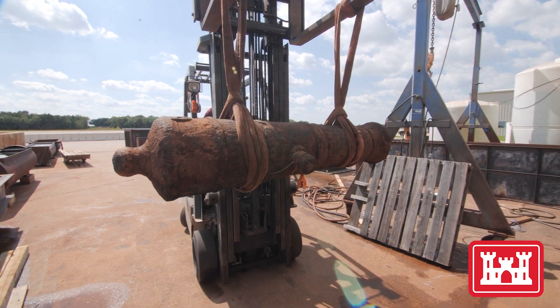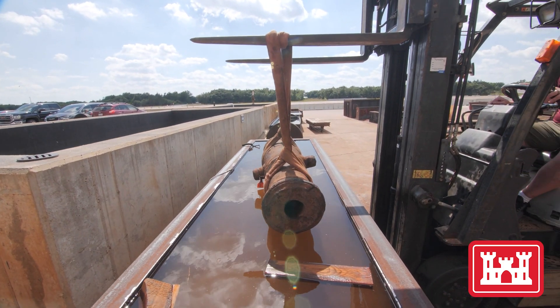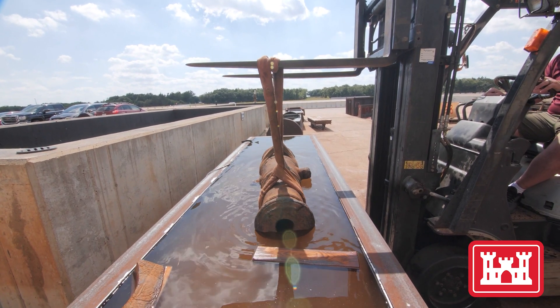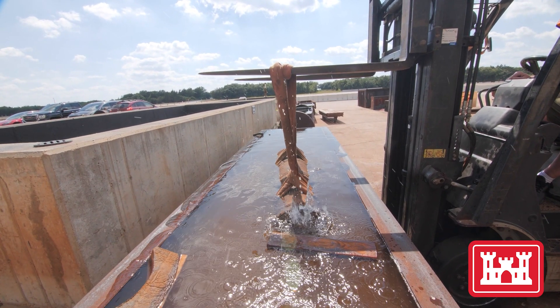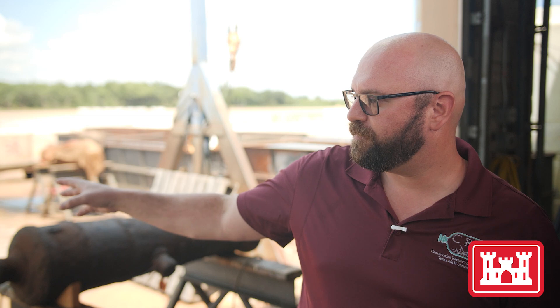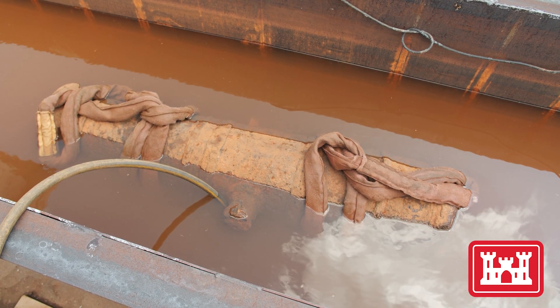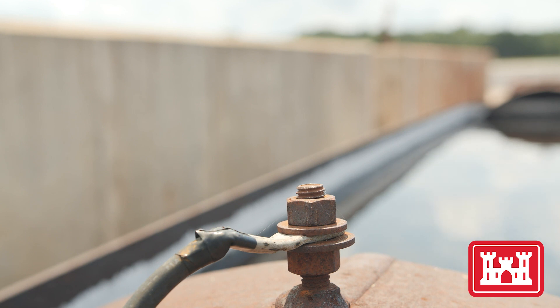Restoring these cannon for display is a complex, multi-step process. The most urgent requirement is to put the iron artifacts into a special bath that removes salts and stabilizes the metal. We're taking the cannon and putting them into a vat, filling the vat up with an electrolyte — in this case, sodium hydroxide — and creating a circuit. We're putting DC current into the cannon, and what it does is push the salts out of the metal. It takes a really long time, upwards of two years in some cases, to get all the salts out. But it's an effective way to get the salts out.